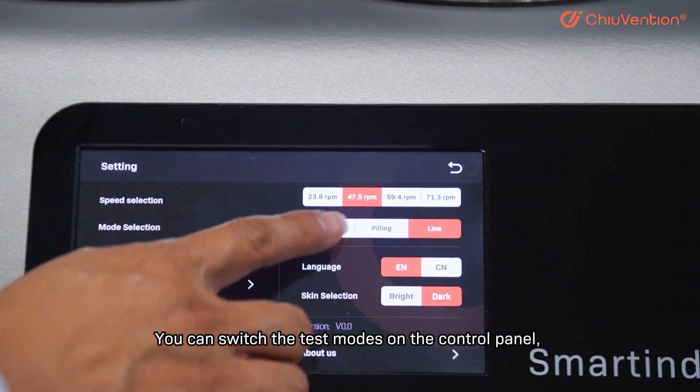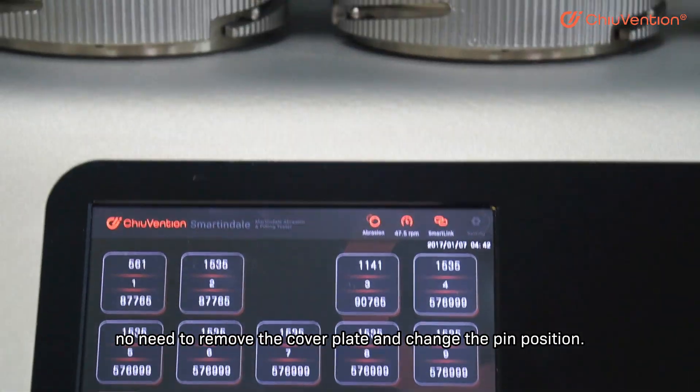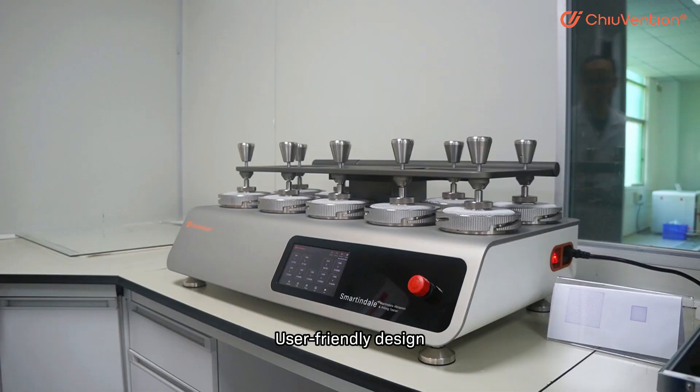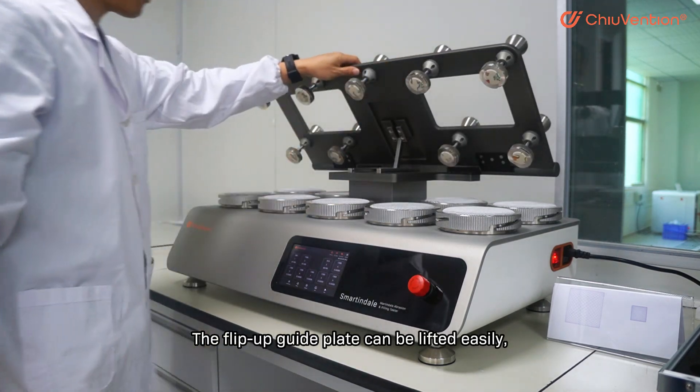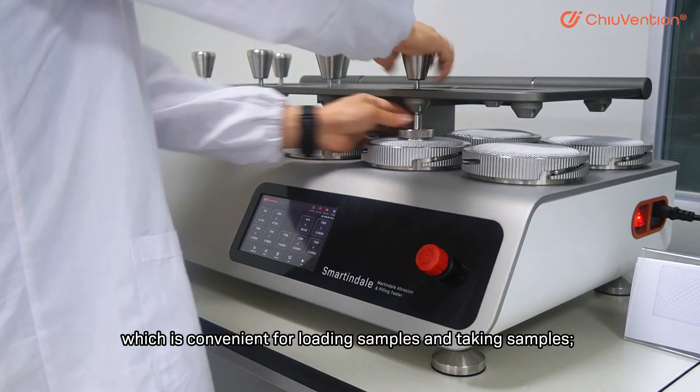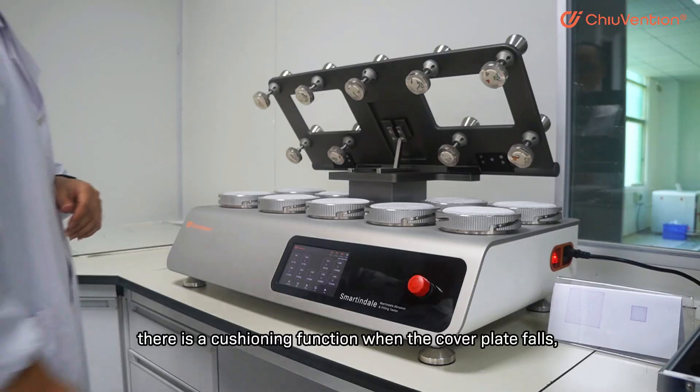No need to remove the cover plate and change the pin position. The user-friendly design features a flip-up guide plate that can be lifted easily, which is convenient for loading and taking out samples.